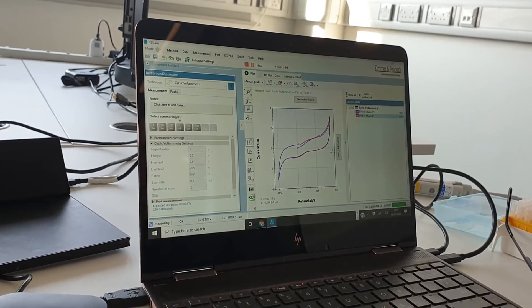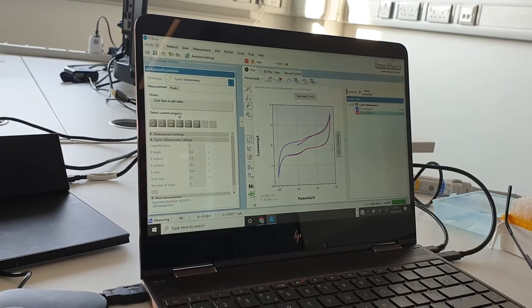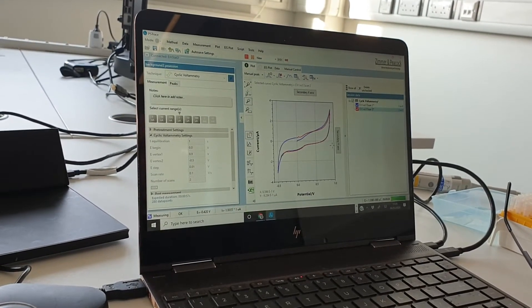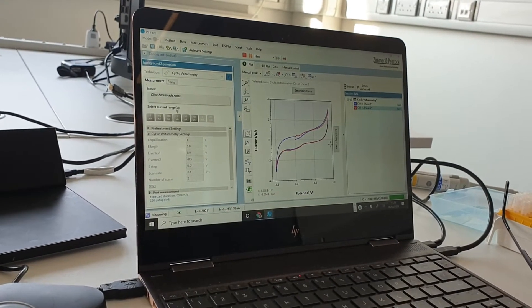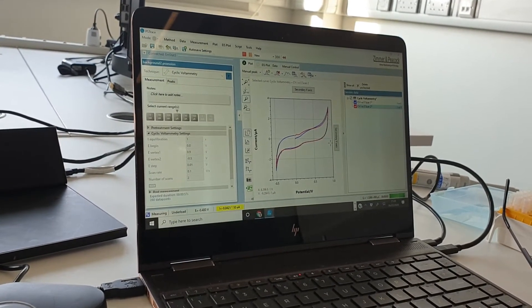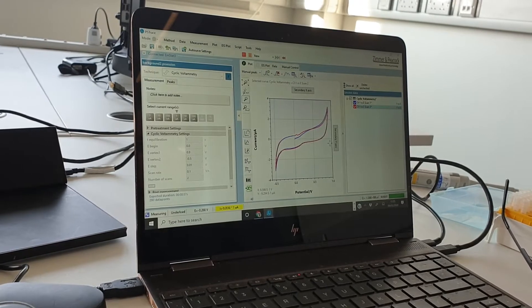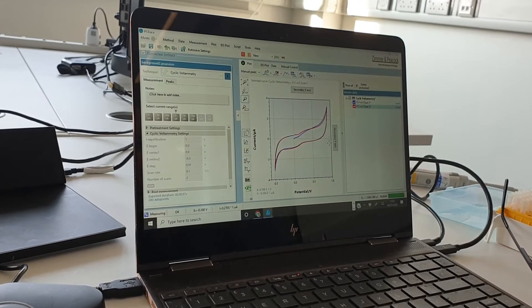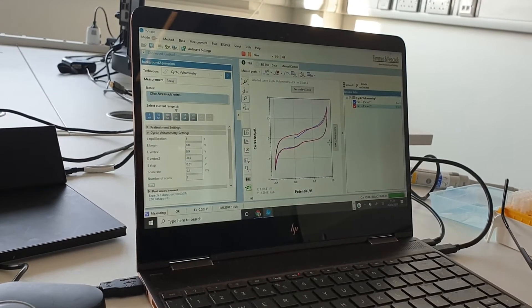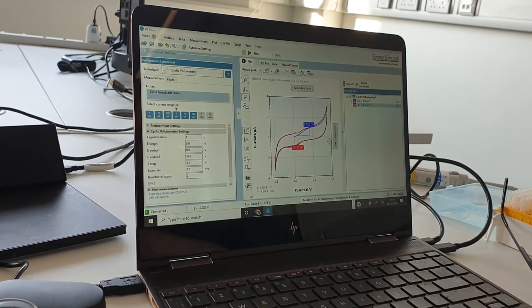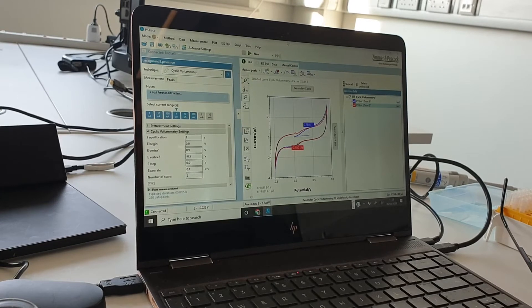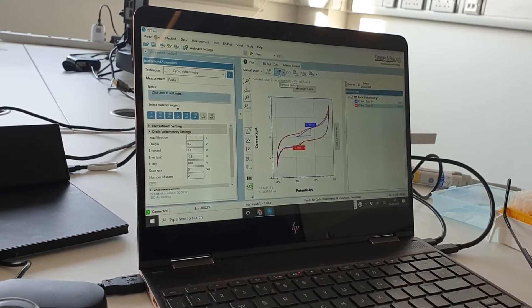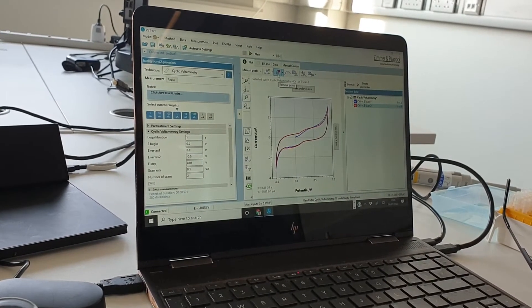We're actually scanning quite fast at the moment. We're scanning at 0.1 volts per second. It's probably advisable to actually start slowing that down a little bit because when you scan very fast it's hard to monitor following kinetics because you've scanned so fast.